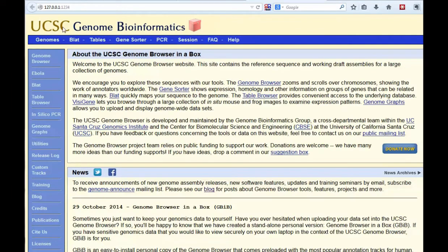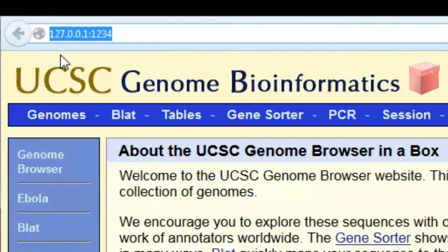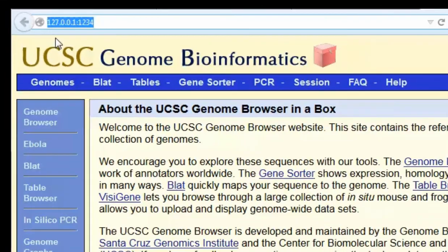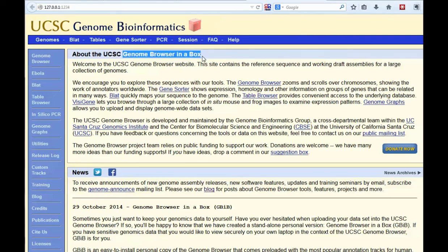Here we are — I've got a browser going. I've put that URL into my address bar, and this is pointing to the VirtualBox that's on my computer. This icon here gives you the reminder that you're on the VirtualBox and not on the main browsing site. So here you are in the Genome Browser in a Box, and you can use it just like any browser session.